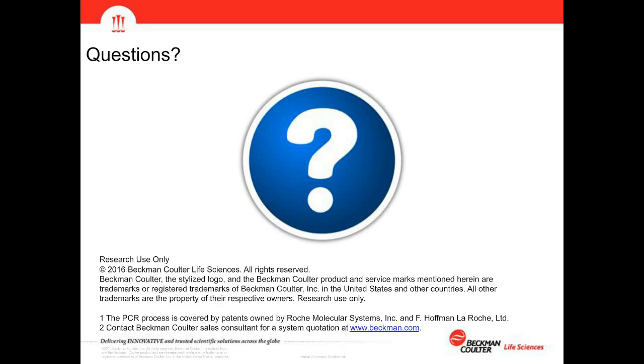And the first question is, for the Biomeks capable of the 384 format, is there a 384 well head, or are you pipetting 4 times with a 96 well head? And further, can the 96 head pipette individual volumes?